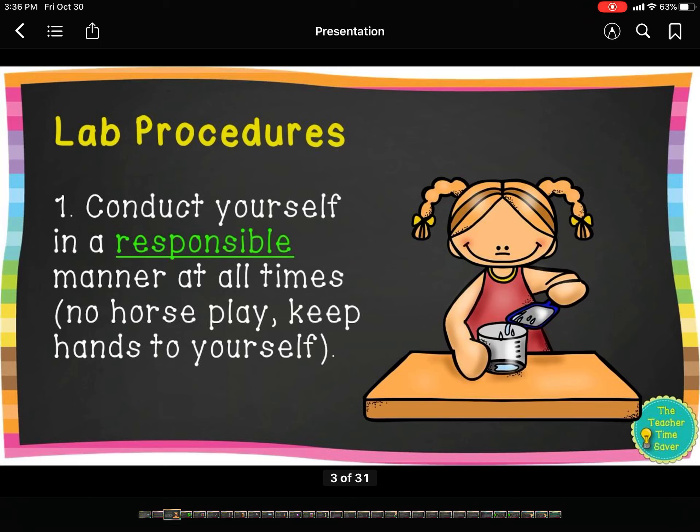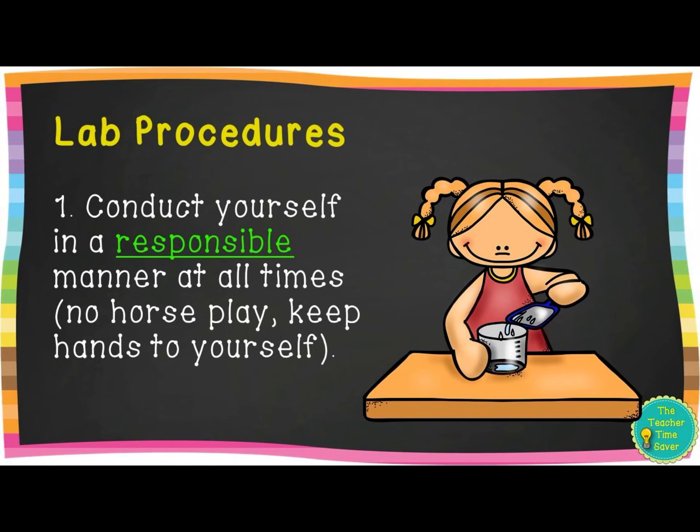The first rule is to conduct yourself in a responsible manner at all times — no horseplay, keep your hands to yourself. You really have to be responsible. The lab we're going to be doing doesn't have that much dangerous stuff, but some labs can be really dangerous. Ask me sometime and I'll tell you about the time I burned my elbow with acid in a chemistry lab in college. So you have to be responsible — no horseplay, keep your hands to yourself.